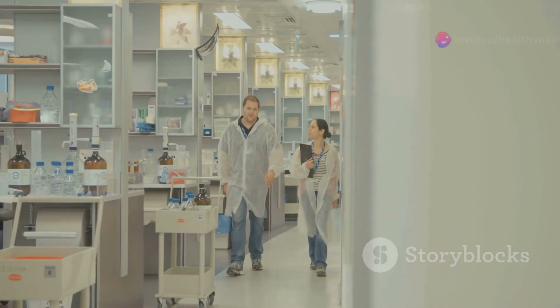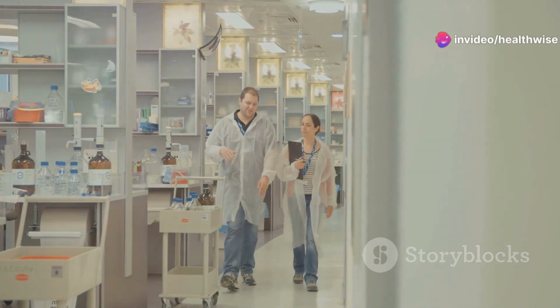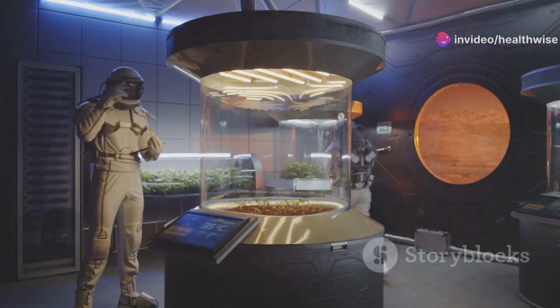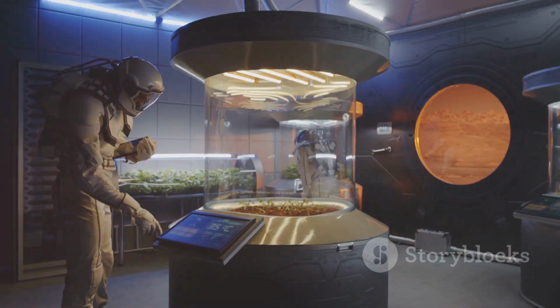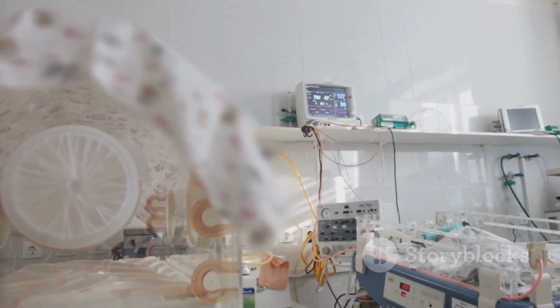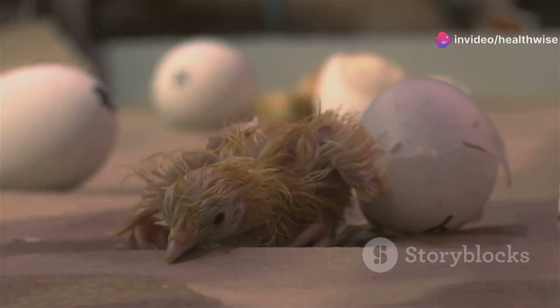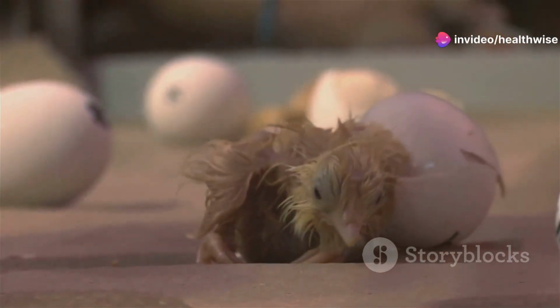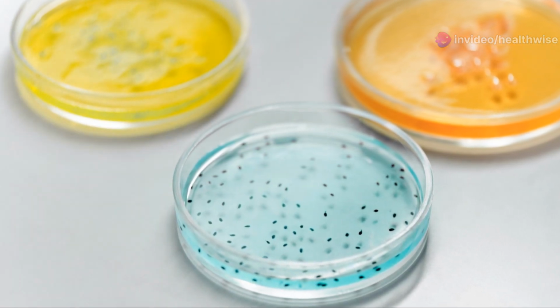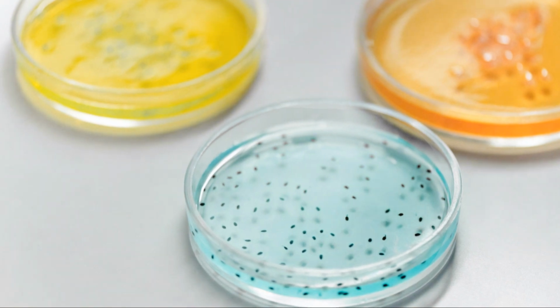There are 4 common types of incubators used in laboratories: simple, anaerobic, carbon dioxide, and cell culture. Each type serves a unique purpose and provides specific conditions for different scientific needs. Simple incubators are the most basic type. They maintain a constant temperature and are often used for general purposes. These incubators are ideal for growing bacterial cultures that do not require special gas environments.